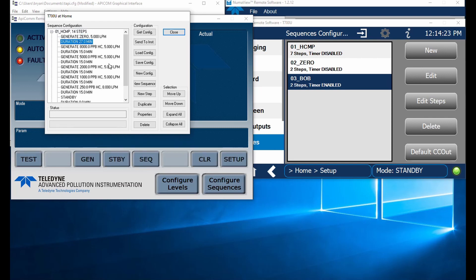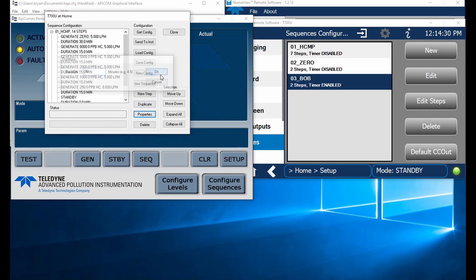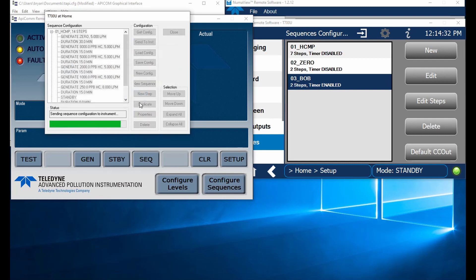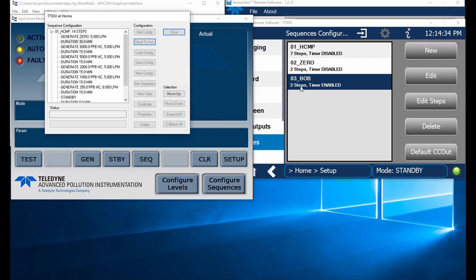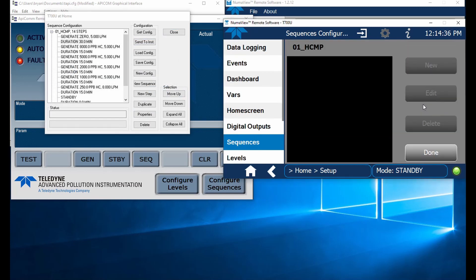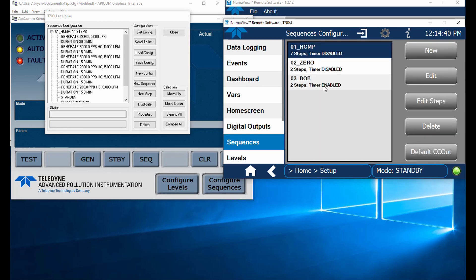Let's go ahead and change this. Maybe I got this as a mistake. I can edit this here. Let's make that 30 minutes again. Let's send that back to the instrument. So now when we come in here and we look at our steps, we'll see it's 30 minutes. That is good.